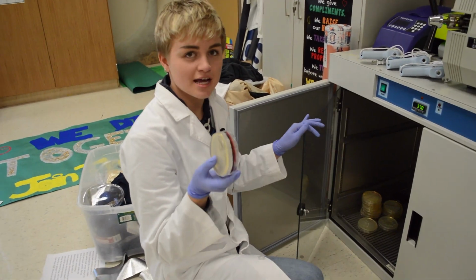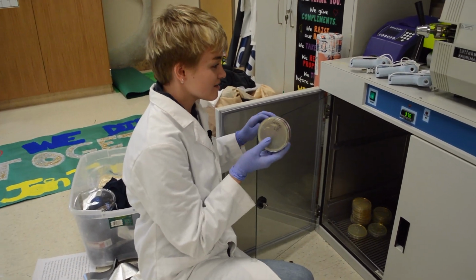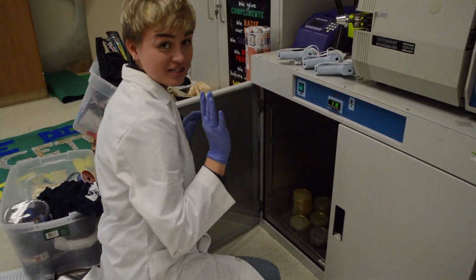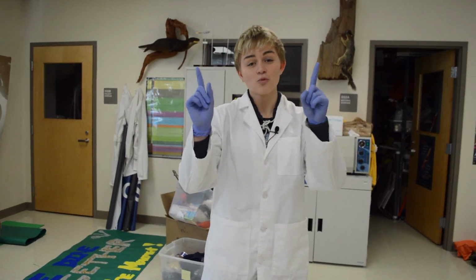Now, after I've streaked and taped up all my plates, they're ready to incubate at 37 degrees Celsius, or body temperature. One eternity later. About a week later, we've got growth.